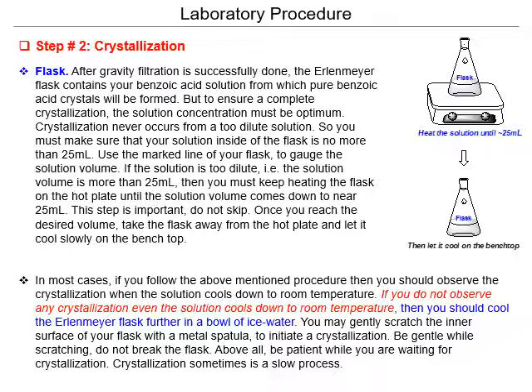In most cases, if you follow the above mentioned procedure, then you should observe the crystallization when the solution cools down to room temperature. If you do not observe crystallization, then you should cool the Erlenmeyer flask further in a bowl of ice water. You may gently scratch the inner surface of your flask with a metal spatula to initiate crystallization.